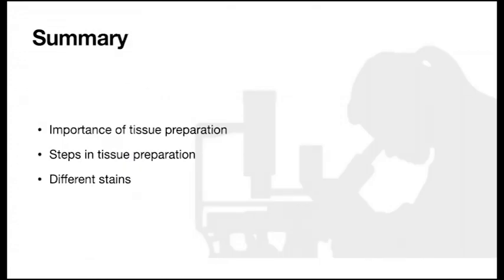In summary, I have discussed the importance of tissue preparation, the different steps that are utilized in tissue or slide preparation, and the different stains or special stains that can be used in order to visualize specific structures. Thank you.